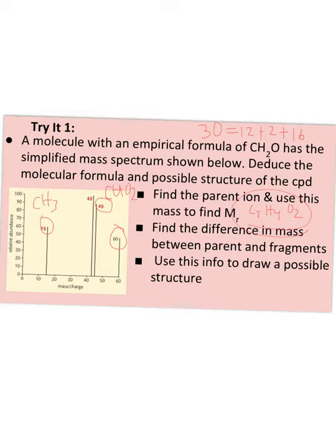If I take a CH3 off for the 15, I'm left with just one carbon, one hydrogen, but both oxygens. So I've got a pretty good idea that this must be a carboxylic acid with just two carbons. The OH here, so there's my COOH group, and then my methyl group, the CH3 on this end.